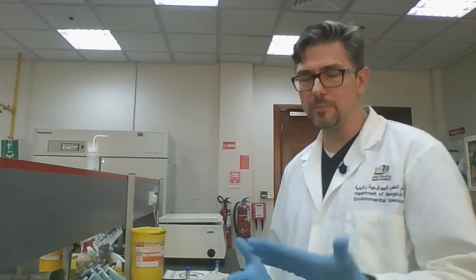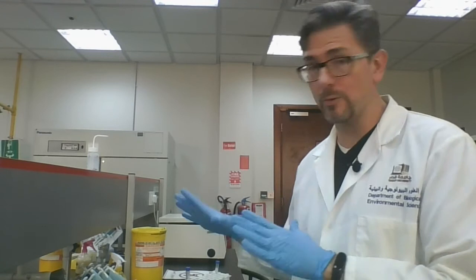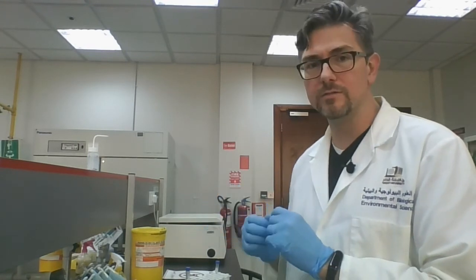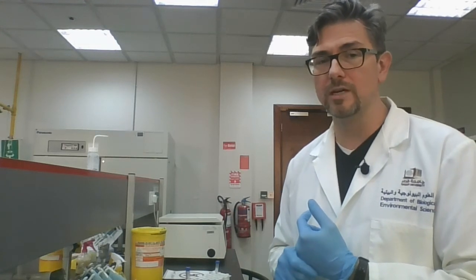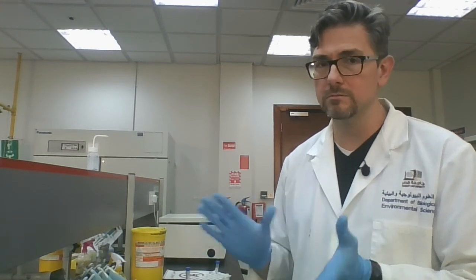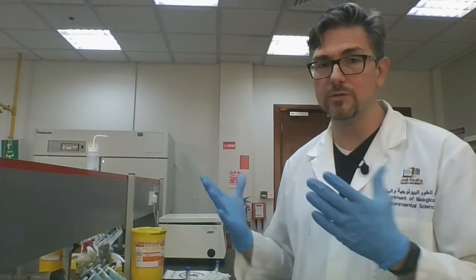Okay, so we're done with our centrifugation. At some point, you might have noticed that I started wearing gloves in this procedure, and that is because of what we were just doing. Basically, the phenol chloroform solution is very corrosive. If it gets on your skin, it is going to hurt. It's going to be one of those cases where you're going to have to run over to the sink and put your hand under running water for a good 10, 15 minutes, and keep rubbing it off until it's been mostly removed. So this is why you want to be wearing gloves for this part of the protocol.